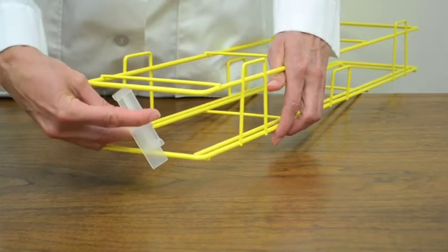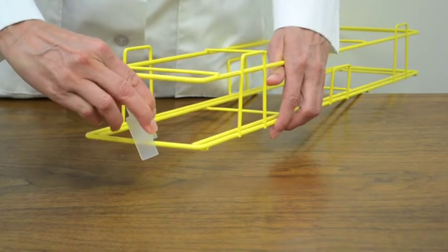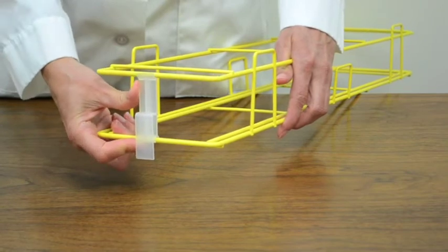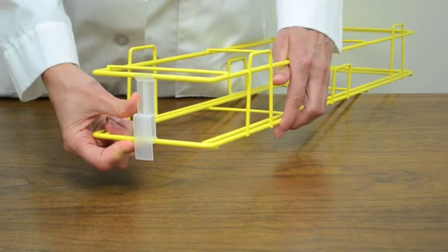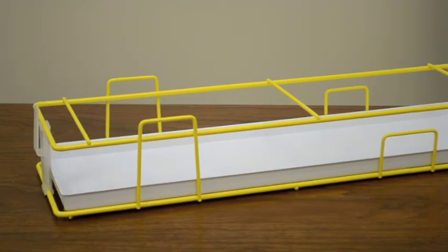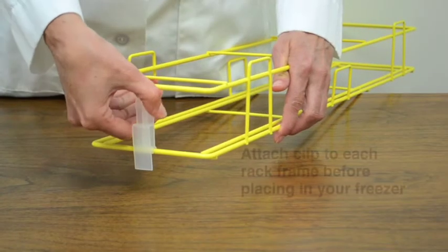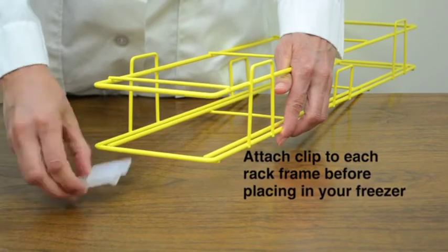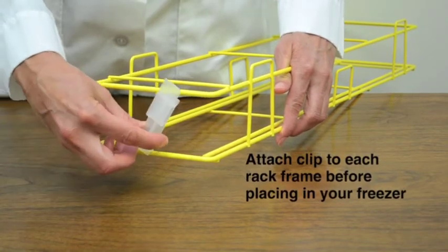Clips serve two purposes. If the tab is down, it prevents the rack from sliding forward in the freezer, and with the tab up or down, it acts as a drawer stop. It should be down for any frame that is on the bottom row and sits right on the freezer rack, and up for any frame that will form higher rows.